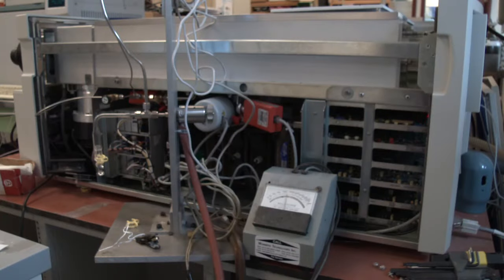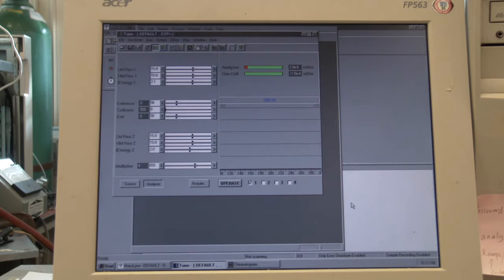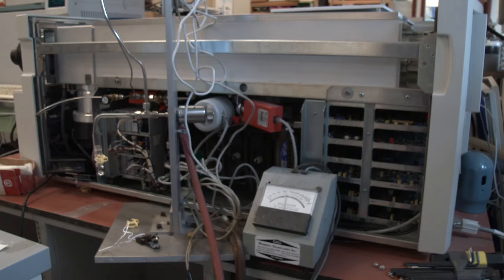In most modern mass spectrometers, the pressure readings at various points along the instrument can be read in the software. It's very important to know where to find these readings. Each manufacturer uses different software, and some hide this information for some cunning reason. In older instruments, the gauges were however connected to pressure meters.